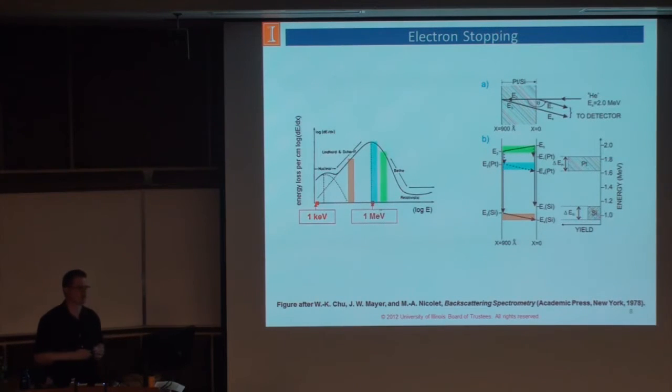And then the second thing that we talk about is electron stopping. We can think of the electron clouds as having a little drag effect on the helium, the alpha particles, as they go through. You can think of it like a projectile flying through air, although in reality you're talking about electric fields, not air, at these sizes. And so the drag on the primary ions gives us information on depth. Usually when you look at a spectrum, you get a convolution of the thickness and the material, and so you can use that information to pull both of those out.